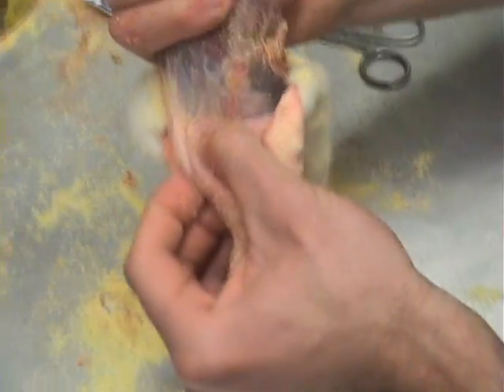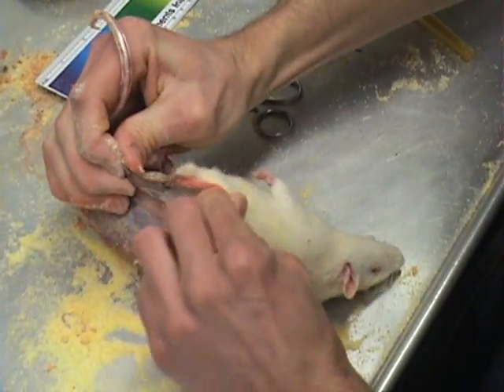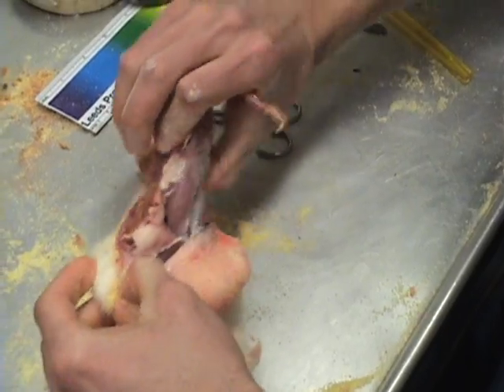Once the tail is passed, begin to work the skin down over the animal. If the animal is extremely bloody or if the guts are coming out, you may want to apply a liberal amount of cornmeal to keep bodily fluids from getting on the pelage.